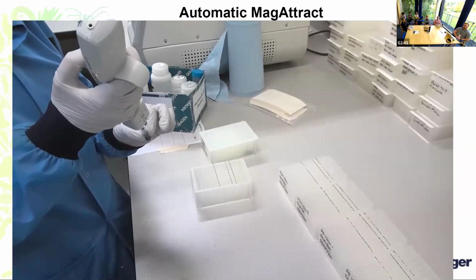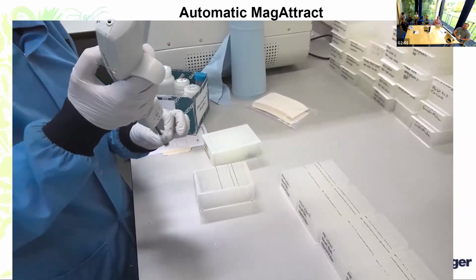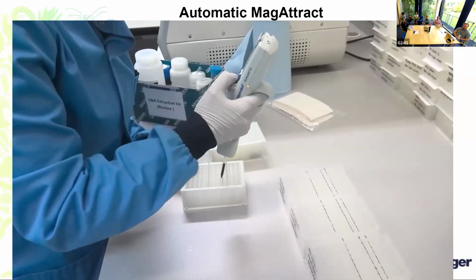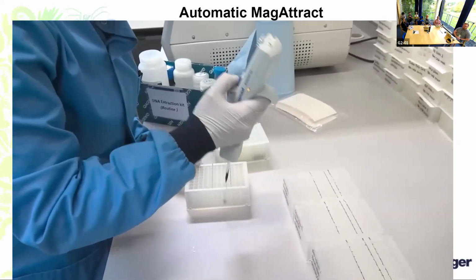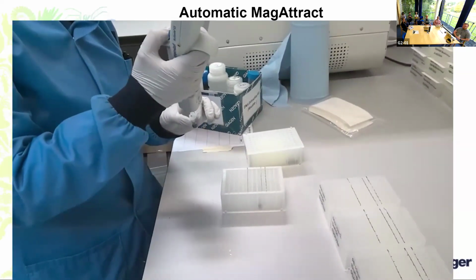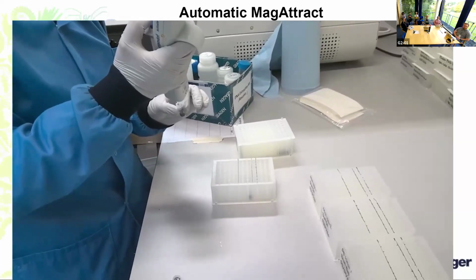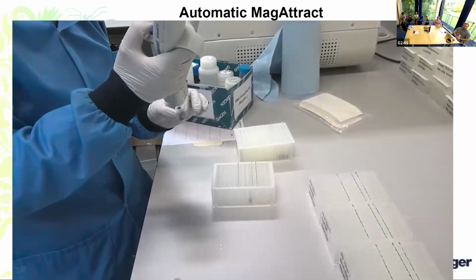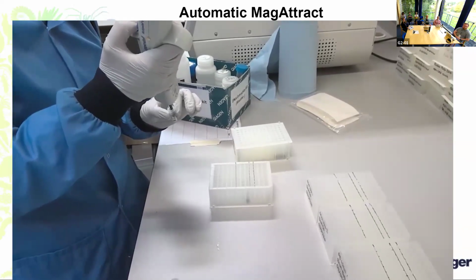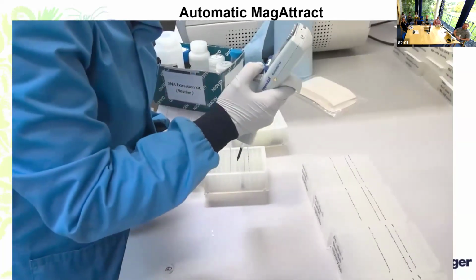What we also prepare is the magnetic bead and binding buffer mixture. We have at the moment 40 microliters of magnetic beads plus 280 microliters of buffer MB, which the samples are added to once they're finished lysing. Obviously when filling plates, we try to use a multi-pipette to prevent any ergonomic issues moving forward.